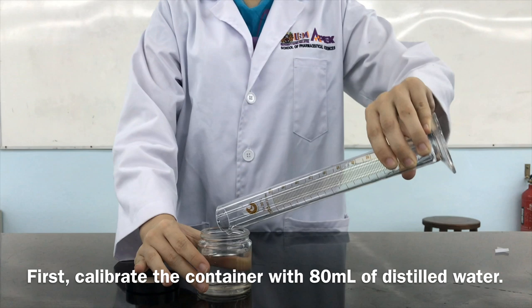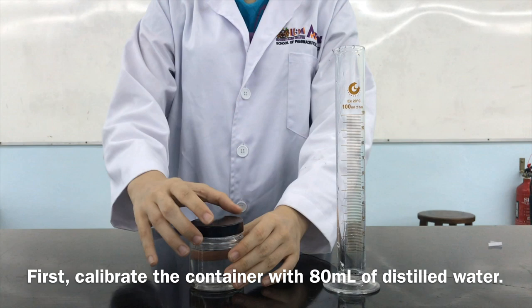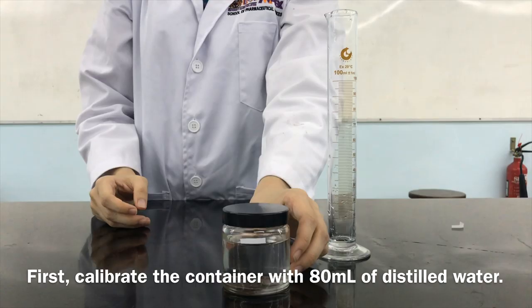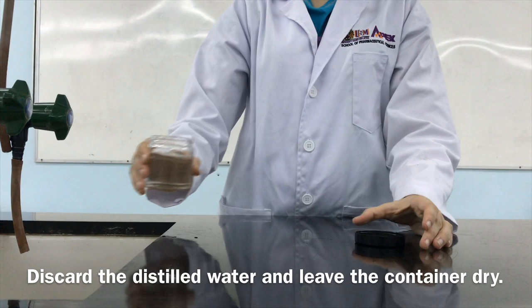First, calibrate the container with 80ml of distilled water. Discard the distilled water and leave the container dry.